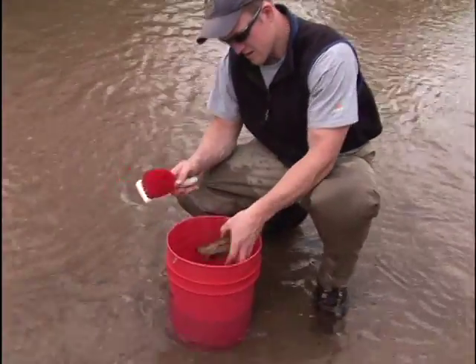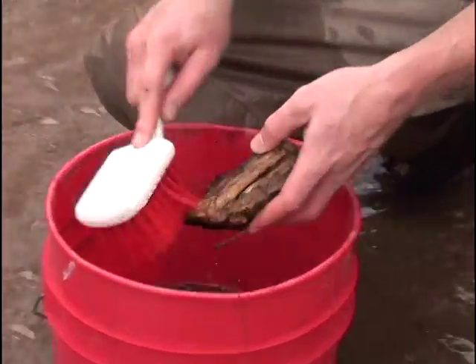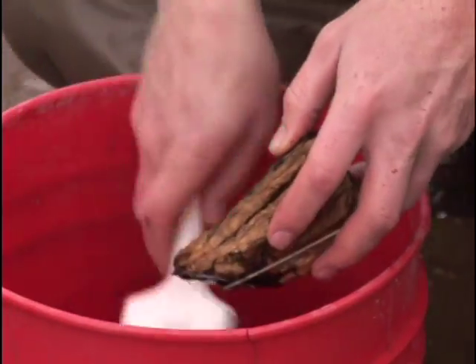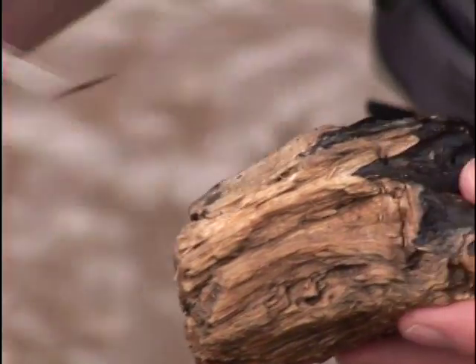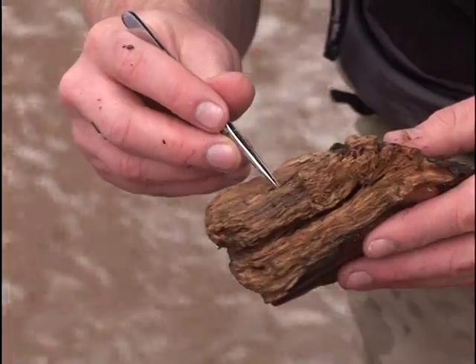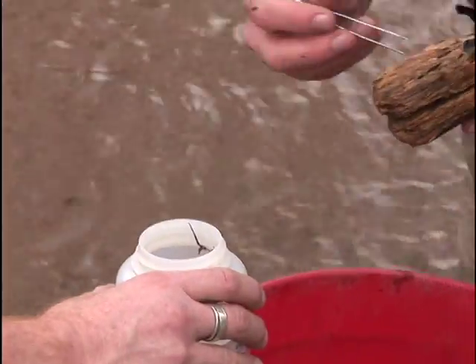Look in the bucket for large rocks or debris that you can handle, such as bare twigs or leaves. Pick them up one at a time. Pluck the organisms off with forceps and place them in the sample jar. Do not rinse over the alcohol-filled sample jar.